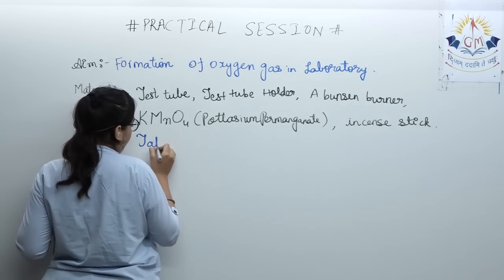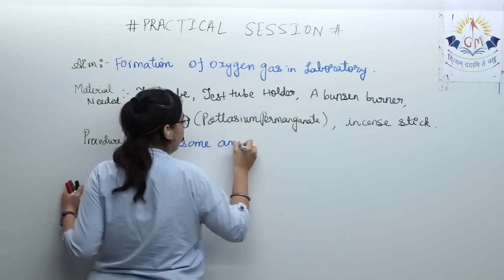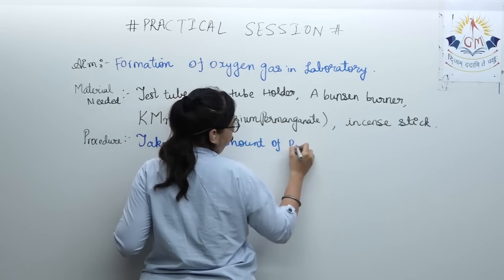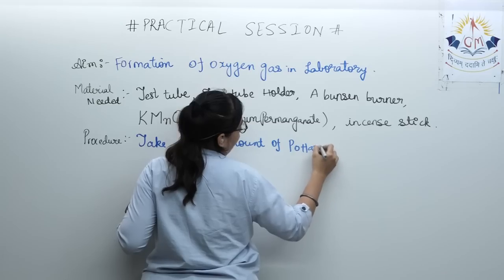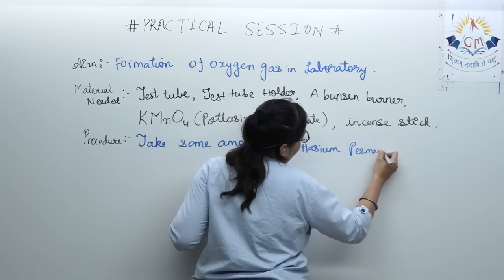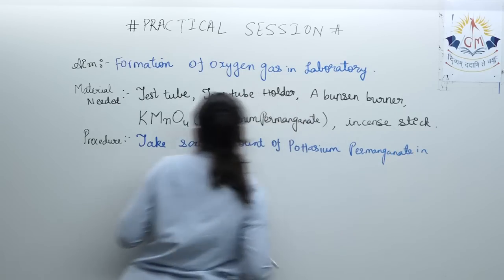Take some amount of potassium permanganate in a test tube.